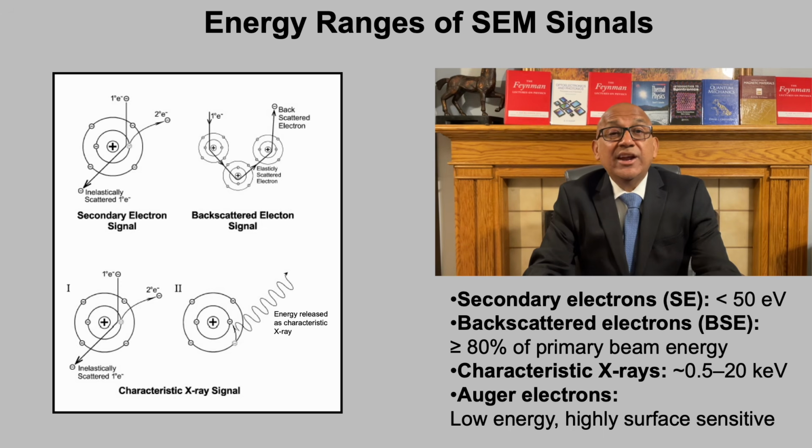Now that we understand the fundamental interaction mechanisms, we can ask a practical question. What energies do the emitted signals actually have? In scanning electron microscopy, different signals span very different energy ranges, and this difference in energy directly determines where the signal originates and what information it carries.